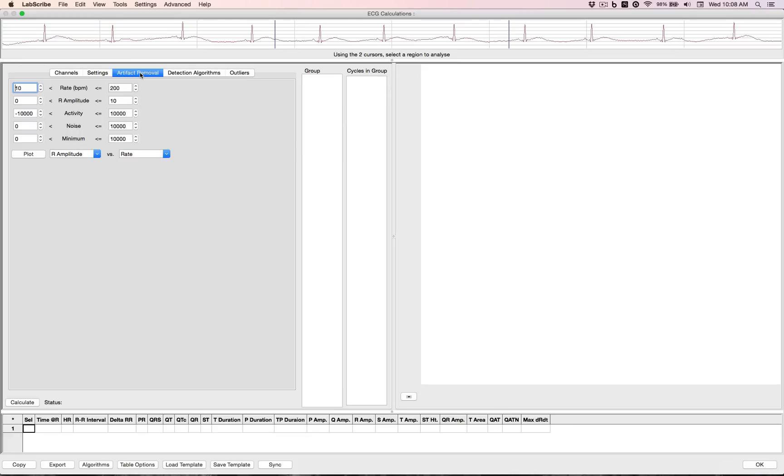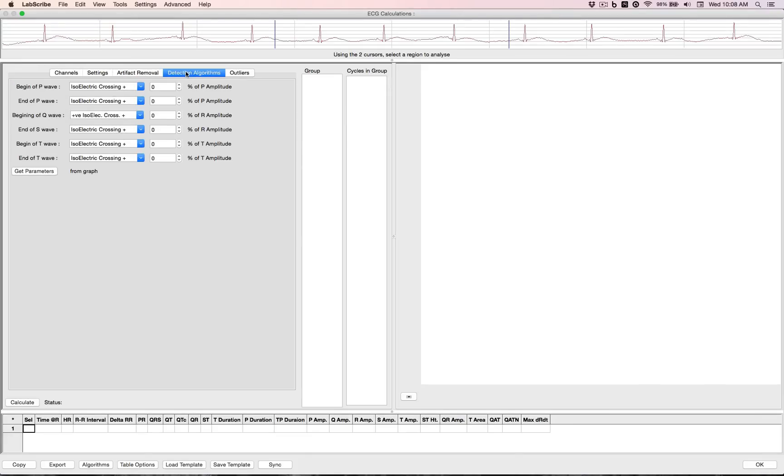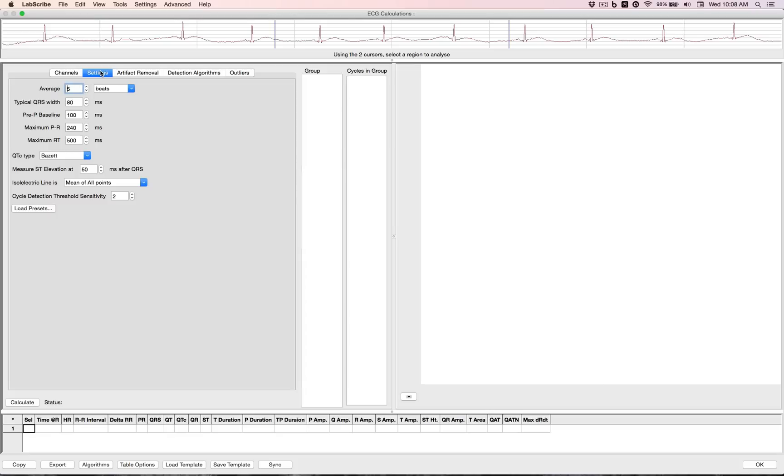We can also adjust for artifact removal and set detection algorithms. At this point, we hit Calculate.